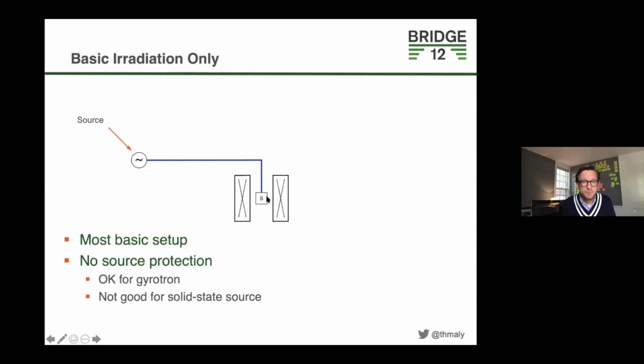Now, the sample here, when it's not an EPR resonator, where when you're on resonance you have maybe minus 60 dB or minus 30, 40 dB reflection, which is almost nothing. But this is just you have reflections from your coil, from your rotor, from your sample, from going through all these different dielectric constants. They all act as mirrors and reflect back.